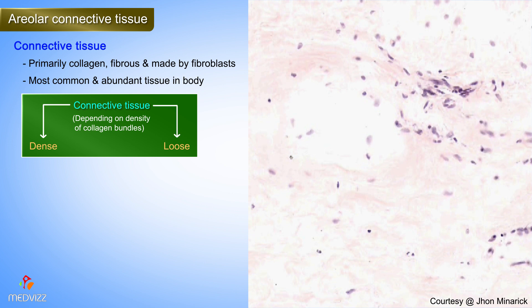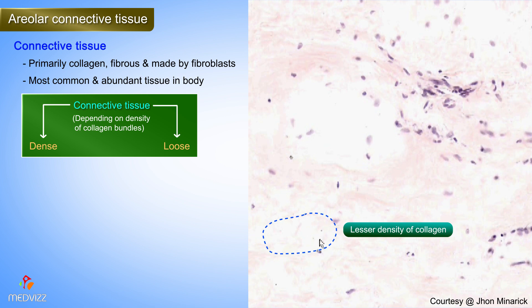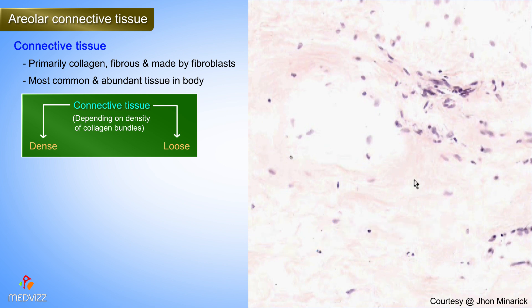Connective tissue can be loose or dense depending on the density of the collagen bundles. An area that is pinker would have a greater density of collagen bundles, versus an area which is lighter, which would have a lesser density. If the connective tissue was very loose, you may often see it interspersed with soft yellow adipose tissue as well.